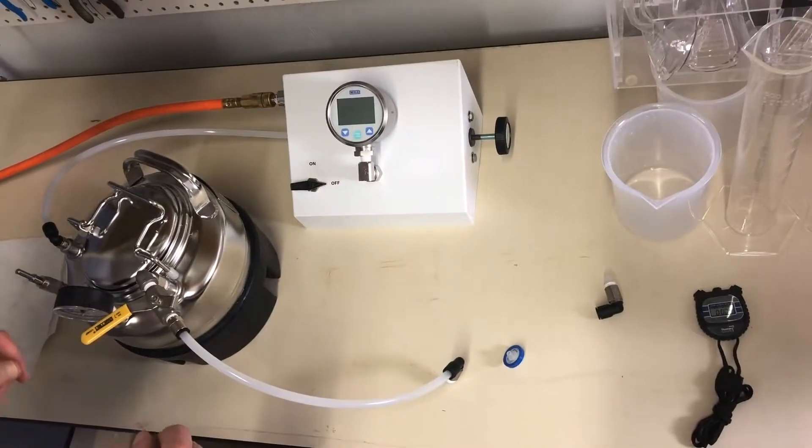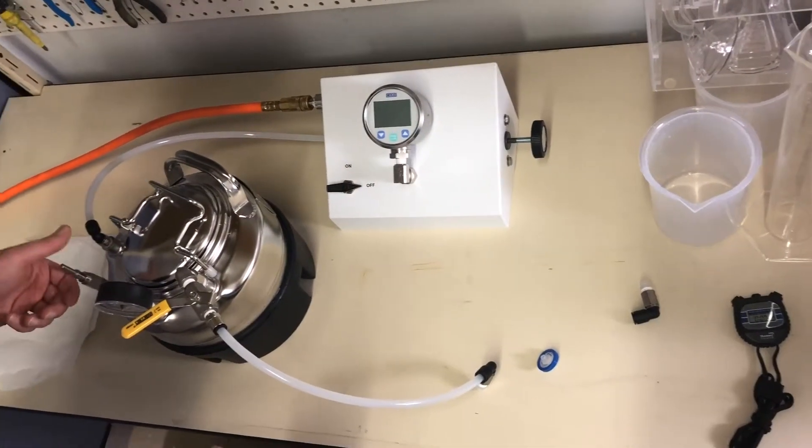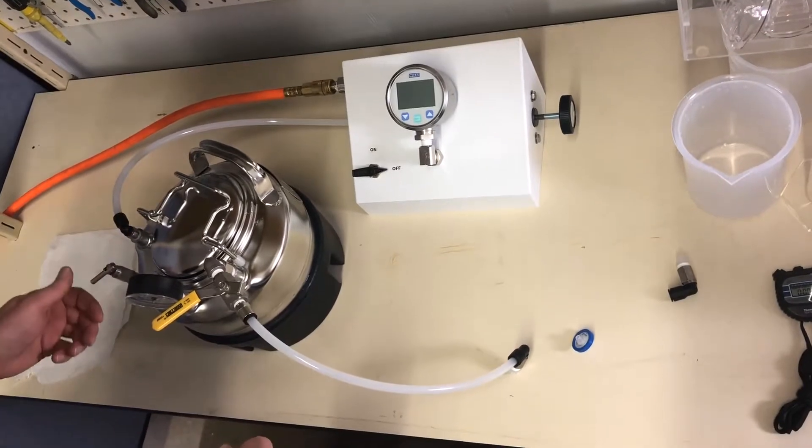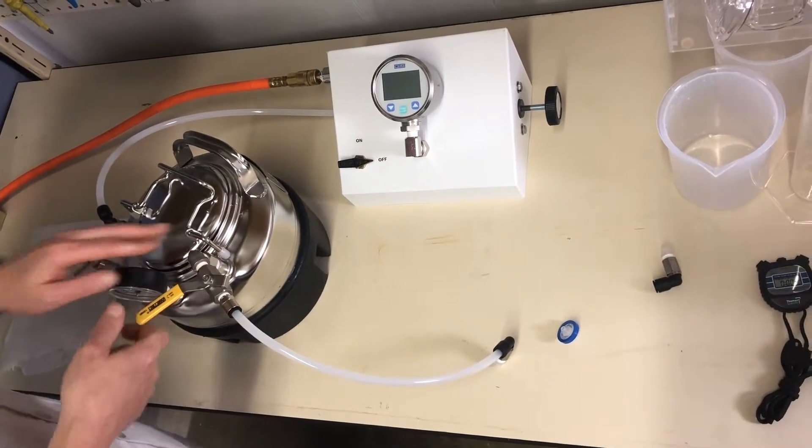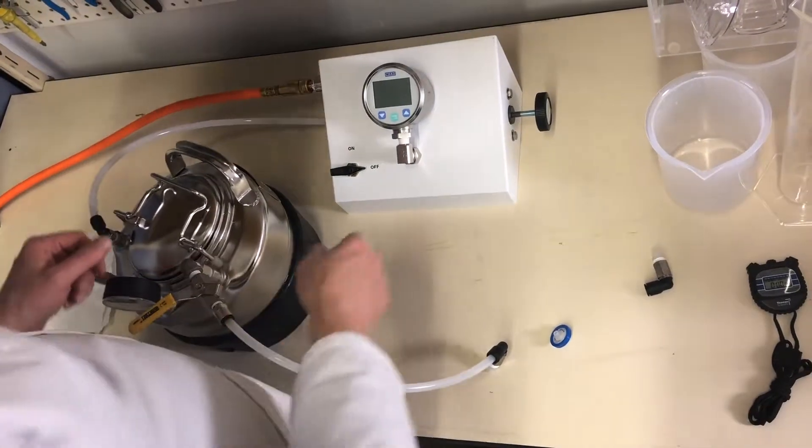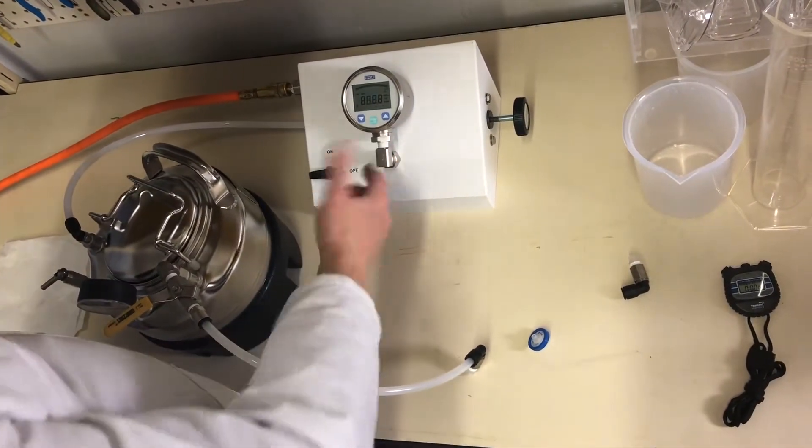Before we apply pressure, we want to make sure the vent on the pressure pot is closed, we want to make sure this valve is closed, the water outlet is closed, then we'll turn on the gauge to make sure it reads zero.